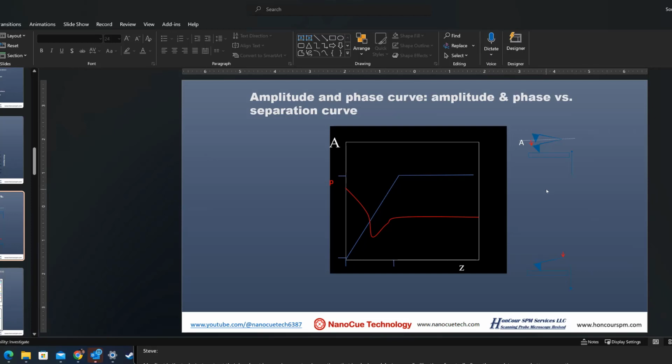Another thing about this water layer is that this attractive force disappears when you are imaging using contact mode inside a water liquid cell. In other words, water is everywhere, there's no water layer, and your attractive force should disappear. That's sometimes true, but sometimes I observe attractive force even when imaging in liquid, let's say water or ethanol. So the attractive force is not just the water layer; other forces play a role too.